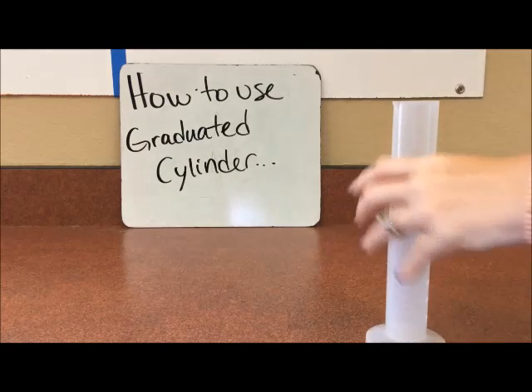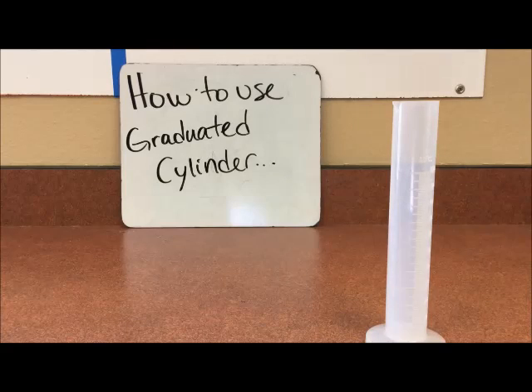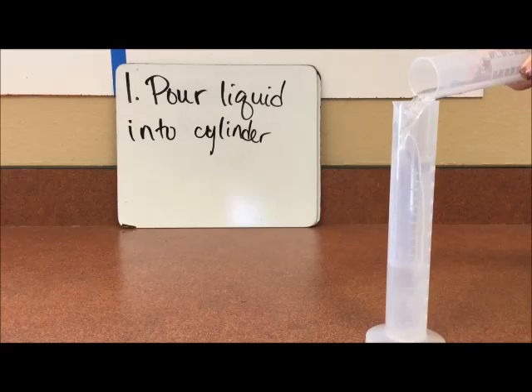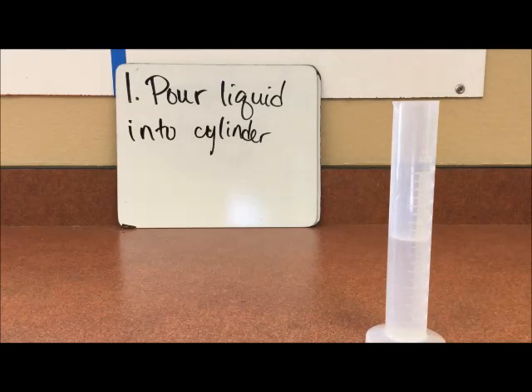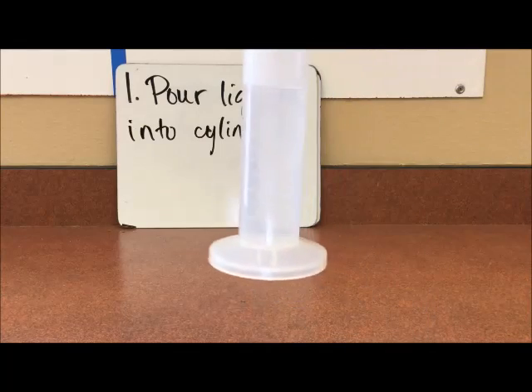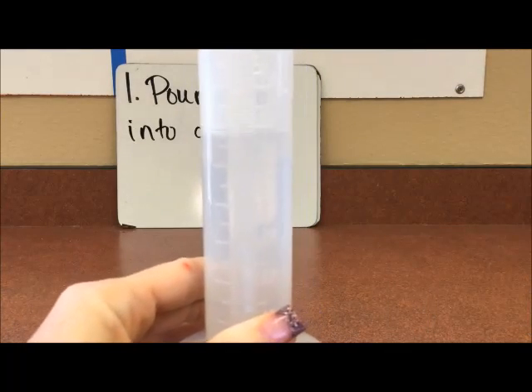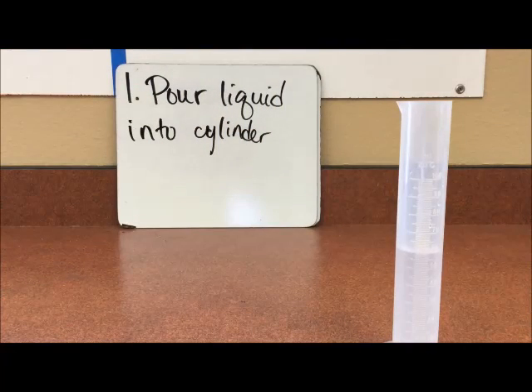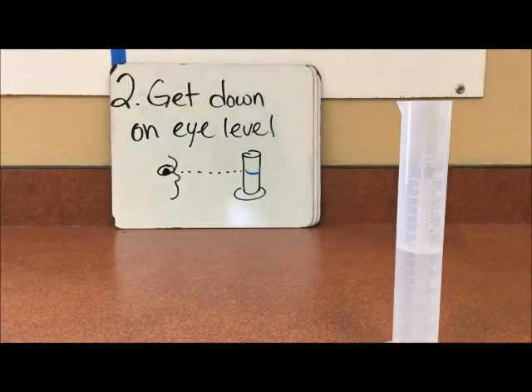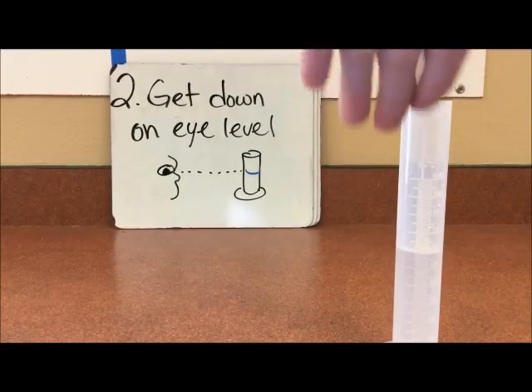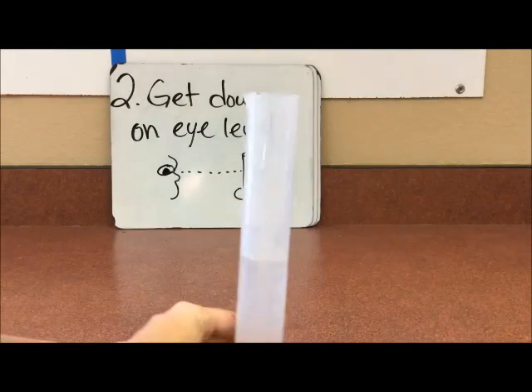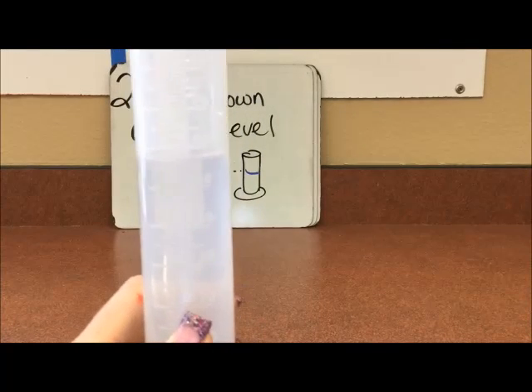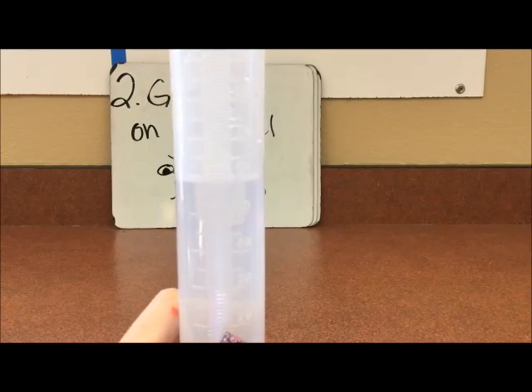So step one: we need to pour our liquid into the container. Okay, so this part's pretty easy. This tool is actually pretty friendly to use, so I'm going to pull it up here so that you guys can have a little look-see at what it looks like when we pour the liquid into the container. Step two: we need to get on eye level. We don't want to read this from way up high or way down low—we want to be on eye level with our water. So let's see if I can get you on the eye level with the camera.